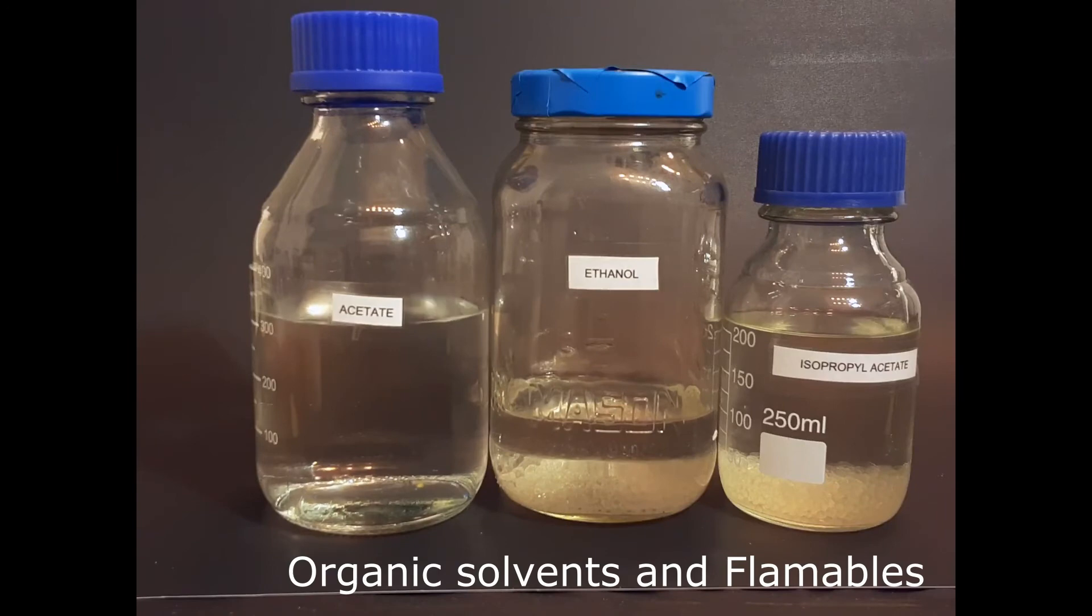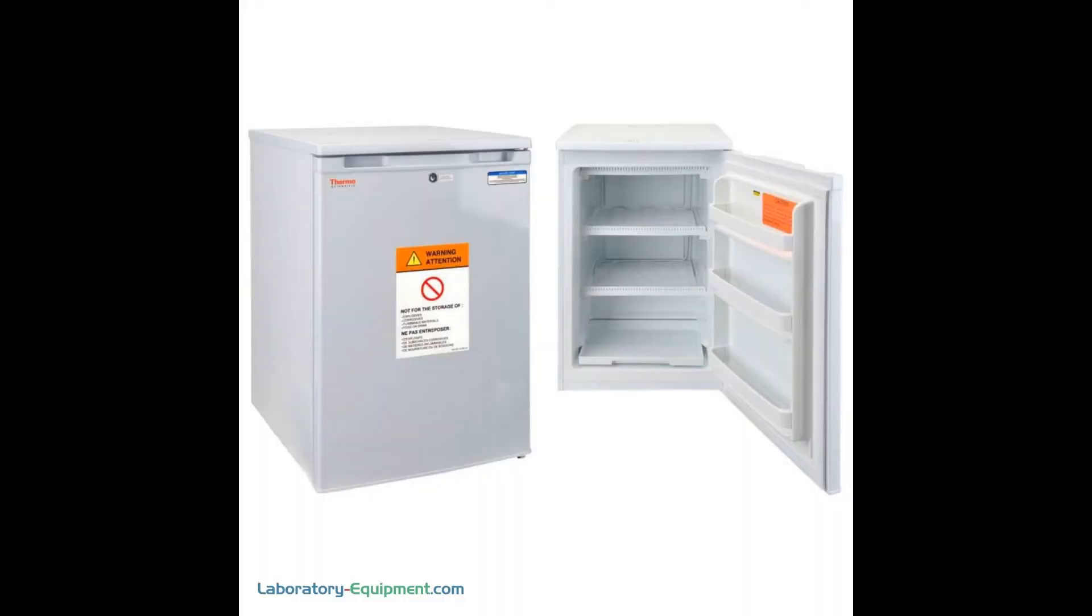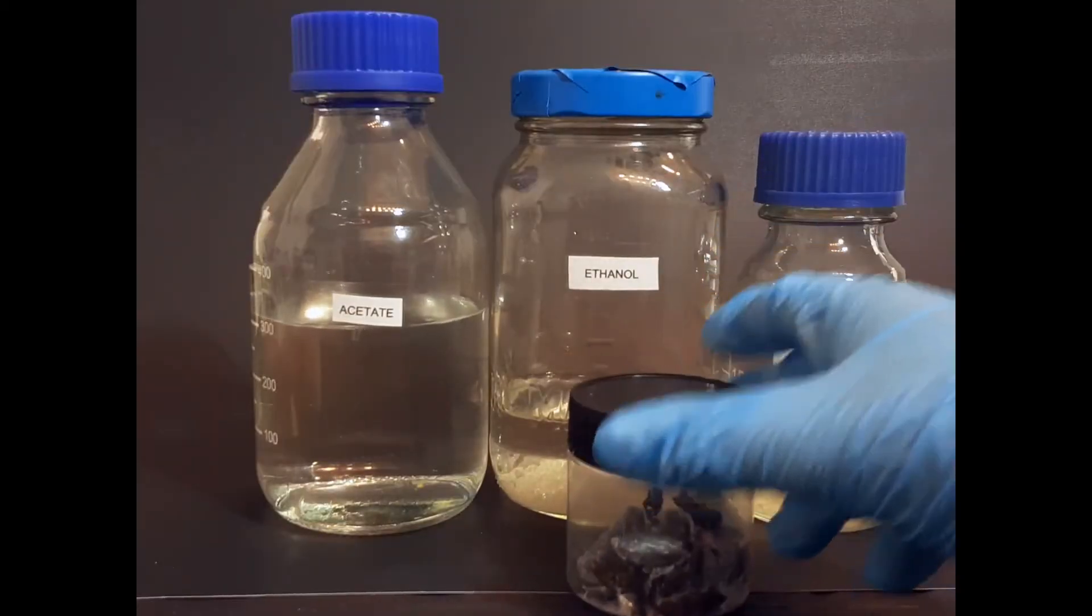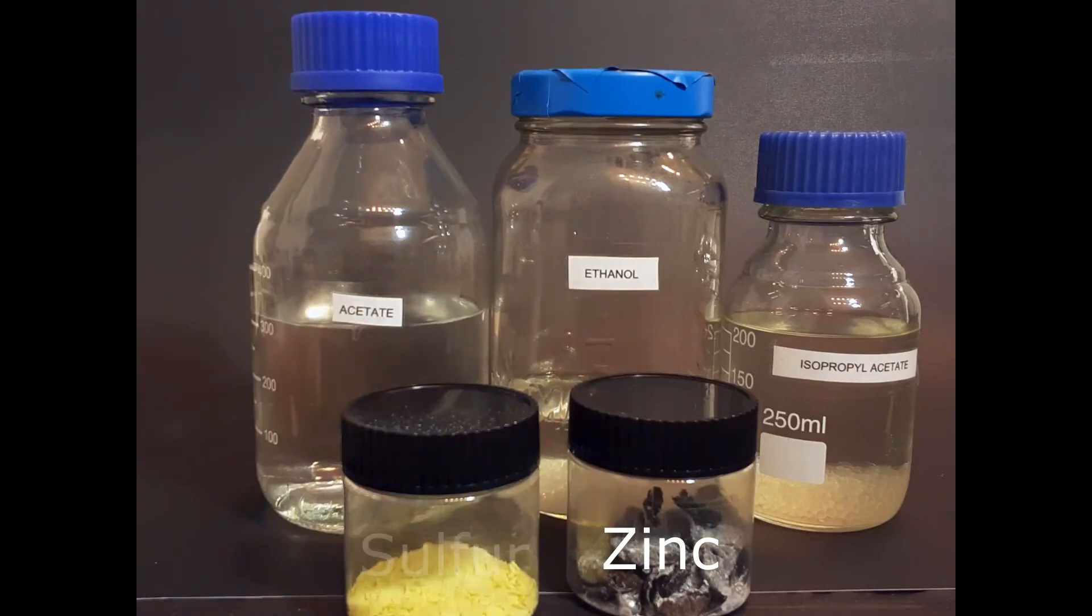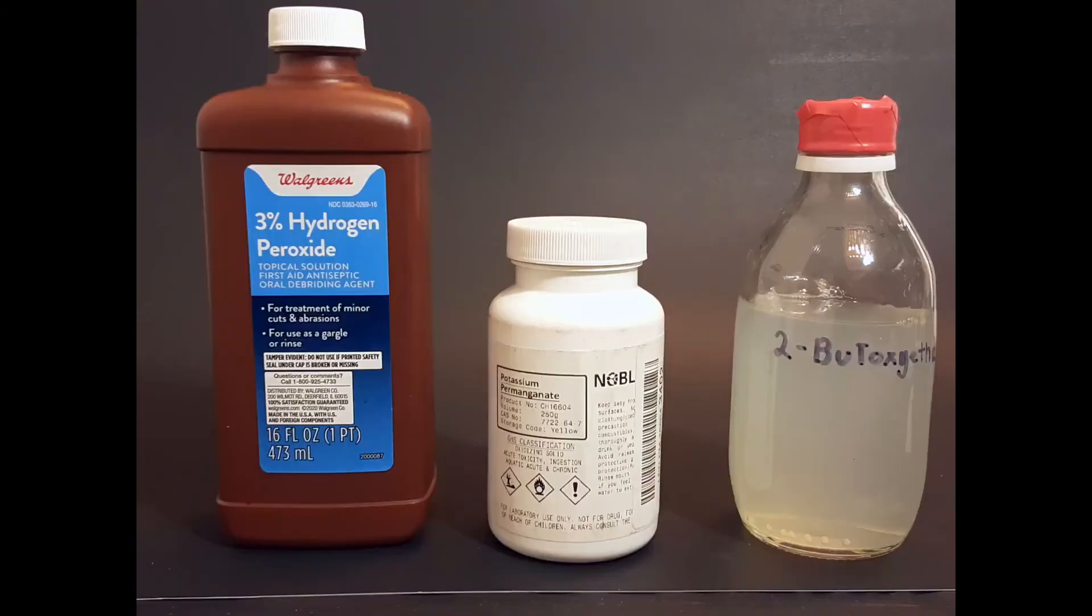Things like organic solvents and flammables should be stored in things like solvent cabinets, flammable cabinets, or fridges. They can be stored with other things like metals and sulfur, but it's not really recommended.